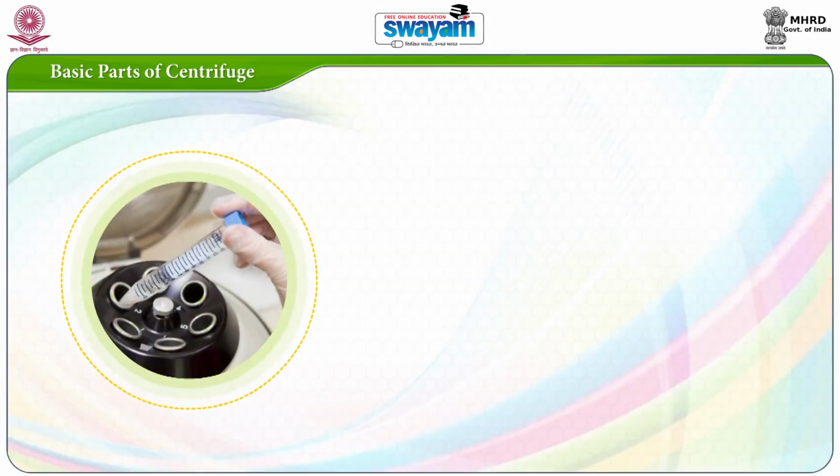Now let us look into the proper care of the centrifuge. Any instrument we use in the laboratory, we should take proper care of. What is the proper care? I told you that every rotor has a speed limit. Horizontal rotors you cannot run at a high speed. Most centrifuges, even if you increase the speed, won't take it. But still, you should be careful that the rotors have a speed limit.